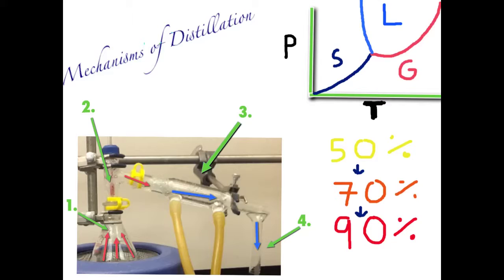Why the inefficiency? Well, we can see our phase diagram here for just about any liquid. In this case, let's say that it was water. We see that the water exists in different phases. It could be in the solid, the gas, and the liquid phase. When it's in its liquid phase, a portion of it is going to be in vapors, which will also be collected along with the ethanol that we're trying to extract.